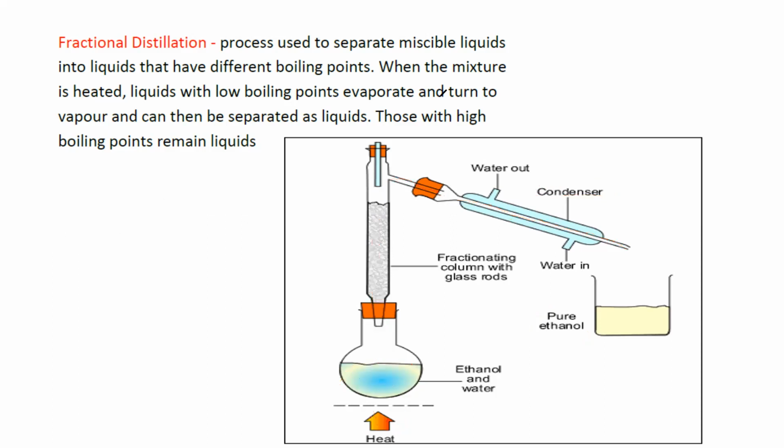The liquid which has a low boiling point will rise, and the liquid with a high boiling point will remain in the flask.